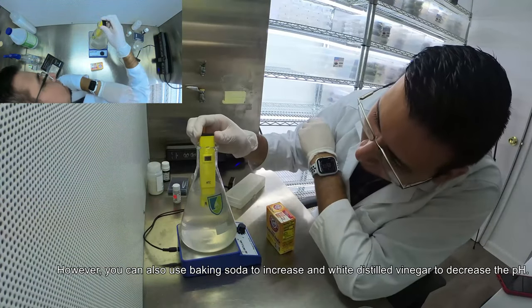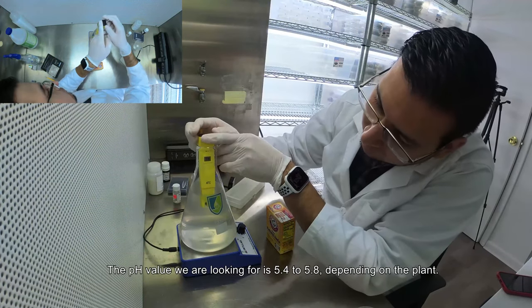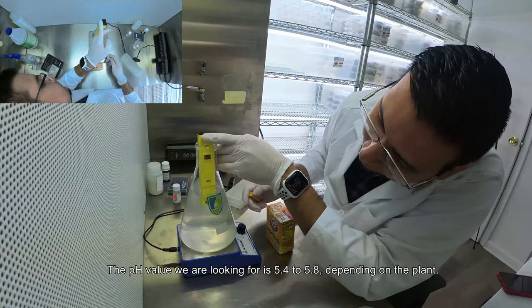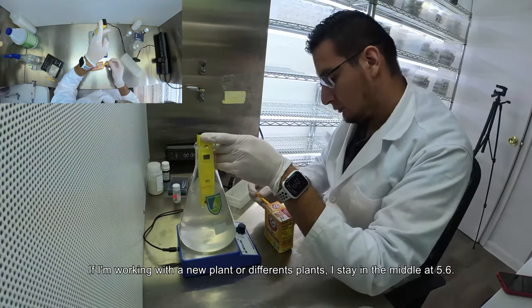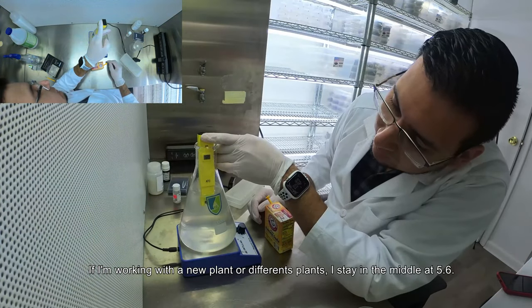And diluted white vinegar to decrease the pH. The pH value we are looking for is 5.4 to 5.8 depending on the plant. If I'm working with a new plant or different plants, I stay in the middle at 5.6.